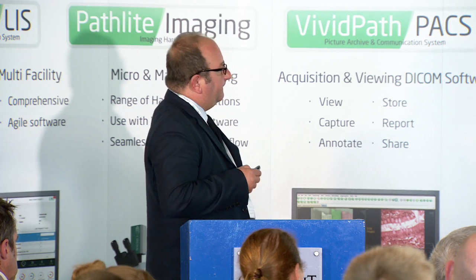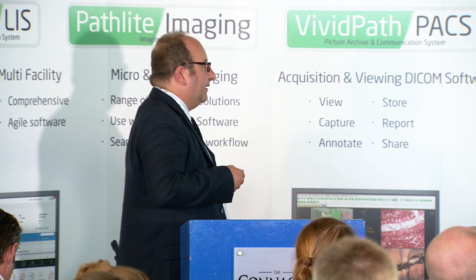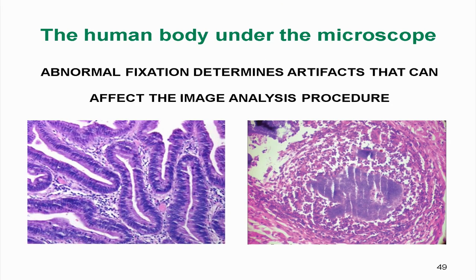Usually, in our laboratory, the duration of fixation is normally 24 hours. And we know that if we change the time or the concentration, maybe change the normal process of fixation, it may affect the result. As seen in these images, we have an overfixation of the tissue, and this obviously cannot be analyzed by using a quantitative approach that gives an objective number.